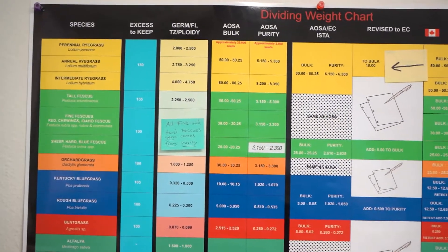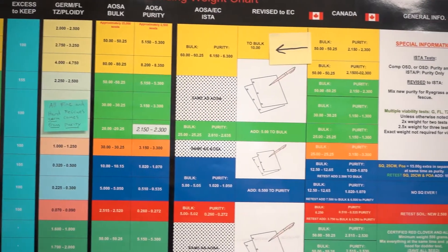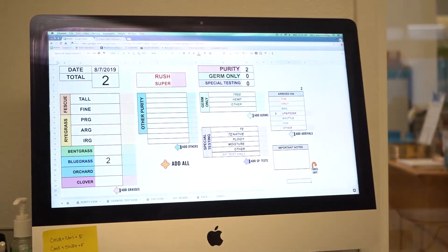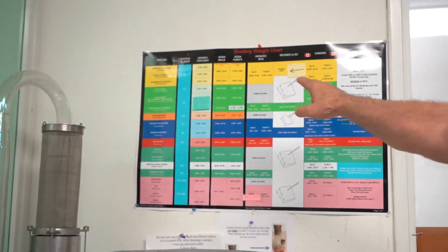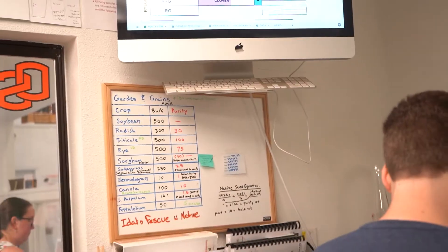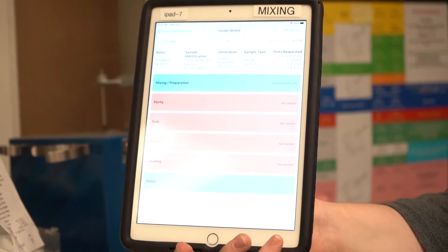It's based on species and which set of rules we have to follow. If this is a normal domestic sample, then we follow those AOSA bulk and purity weights and we will weigh those out. If it's going to Canada, we have to follow the Canadian rules, and so the weights could differ slightly. We always check the charts to make sure that we're following the weights that are prescribed in the rules for the country or area where that seed is going to be sold.